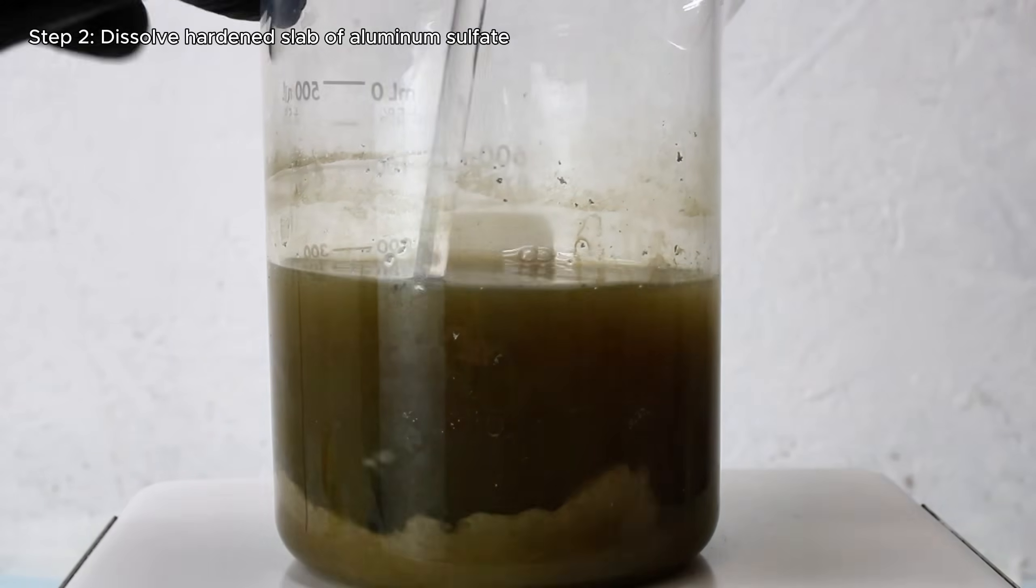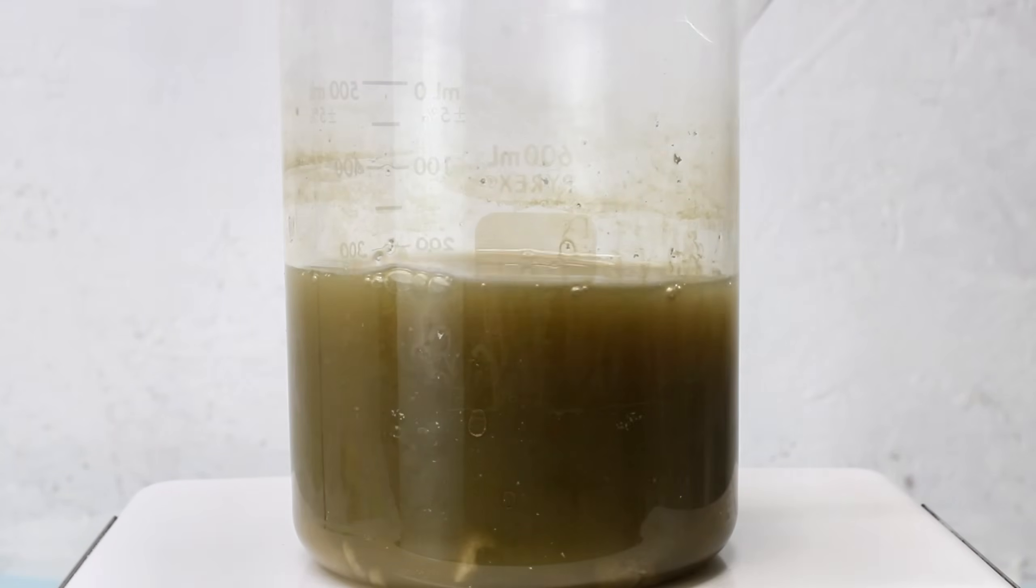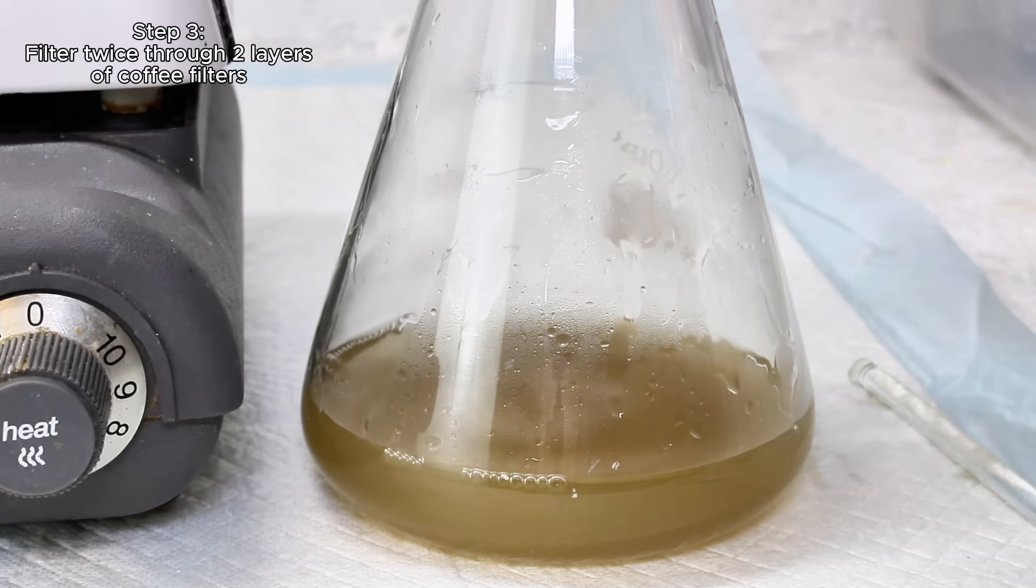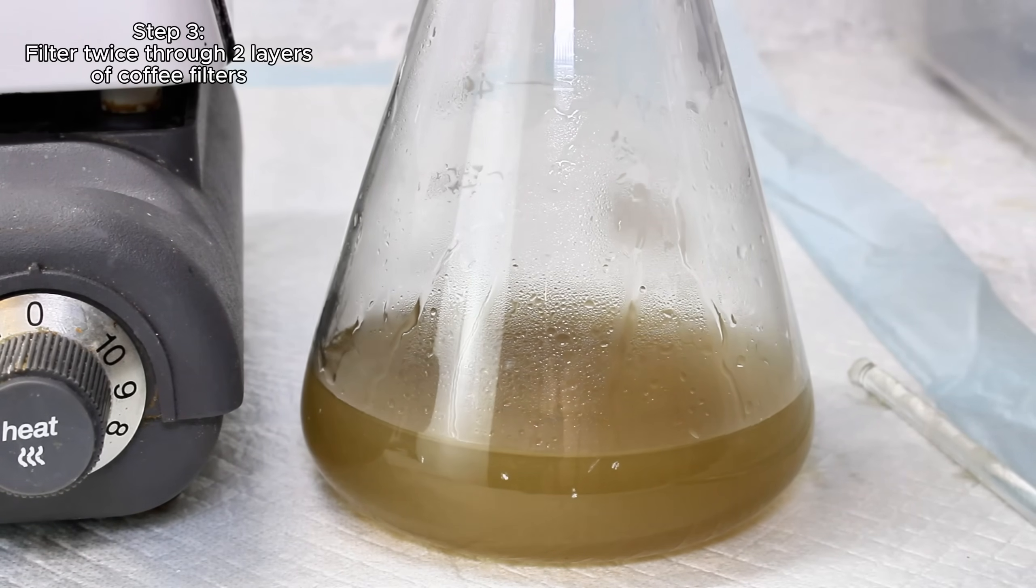When I came back the next day, this had fused into a solid mass of aluminum sulfate, which is also a form of alum called papermaker's alum, and can be used in a lot of the same ways as potassium alum, but it's far harder to crystallize.